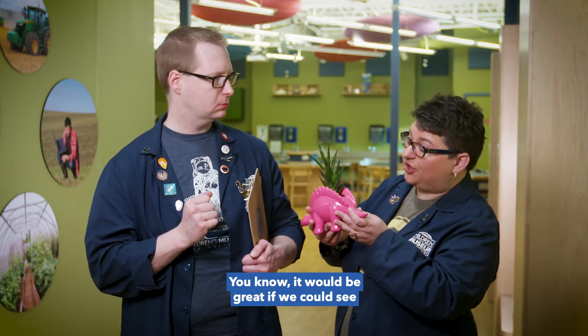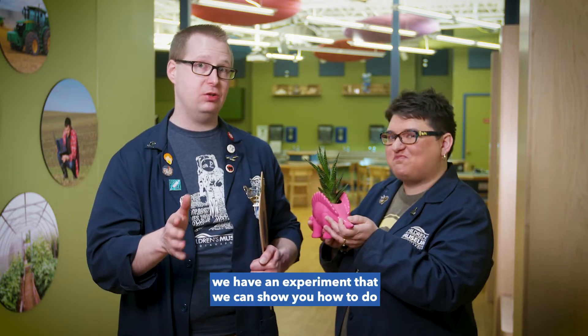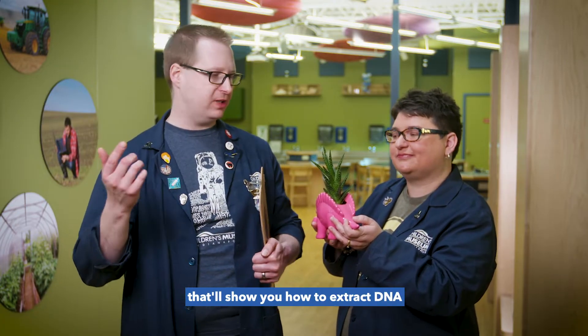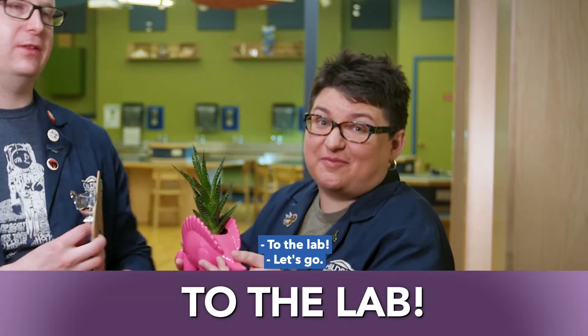That is really cool. It would be great if we could see what DNA looks like. Actually, we can! We have an experiment that we can show you how to do with stuff you may have lying around the house, that'll show you how to extract DNA from plant cells and look at it without using a microscope. That's amazing. Let's go do it. To the lab!